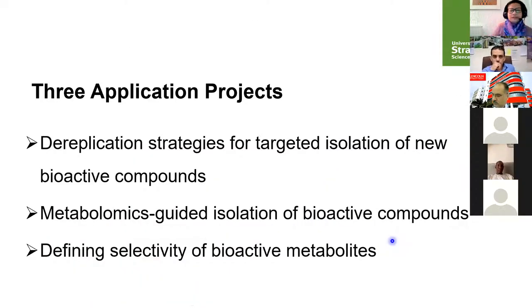So as examples, there will be three application projects that I will present. The first one is an example of a dereplication strategy for targeted isolation of new metabolites. The second one is a metabolomics guided isolation of bioactive compounds. And the third example is defining selectivity of bioactive metabolites.